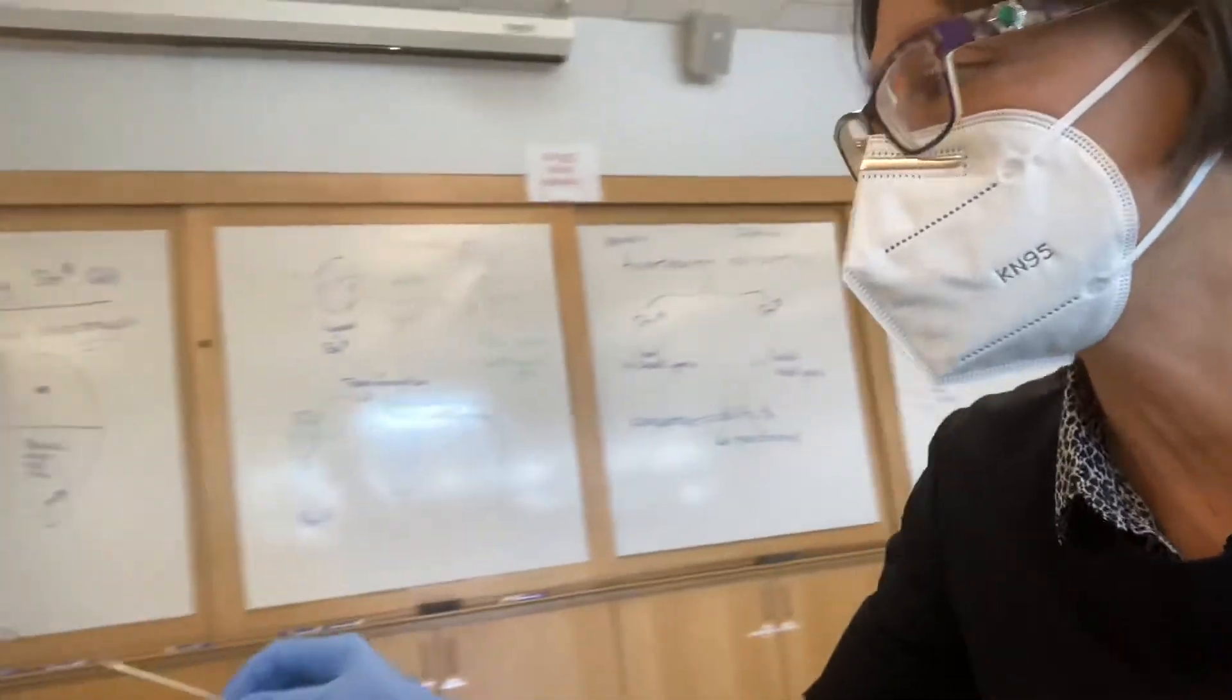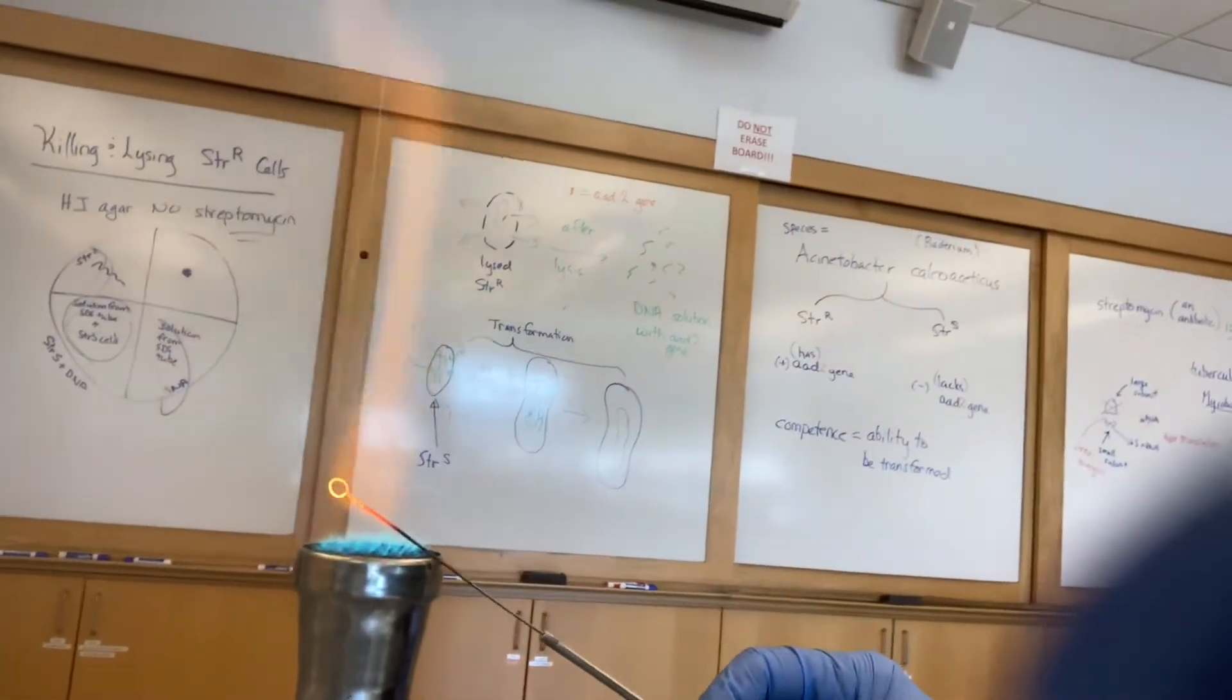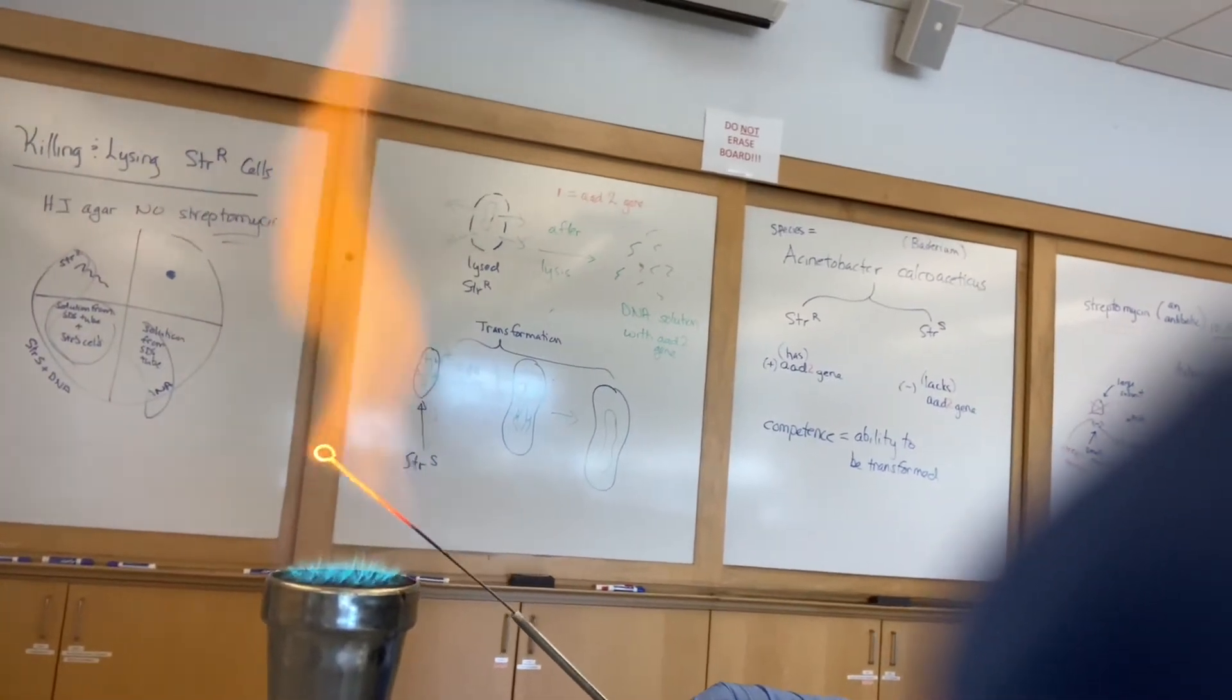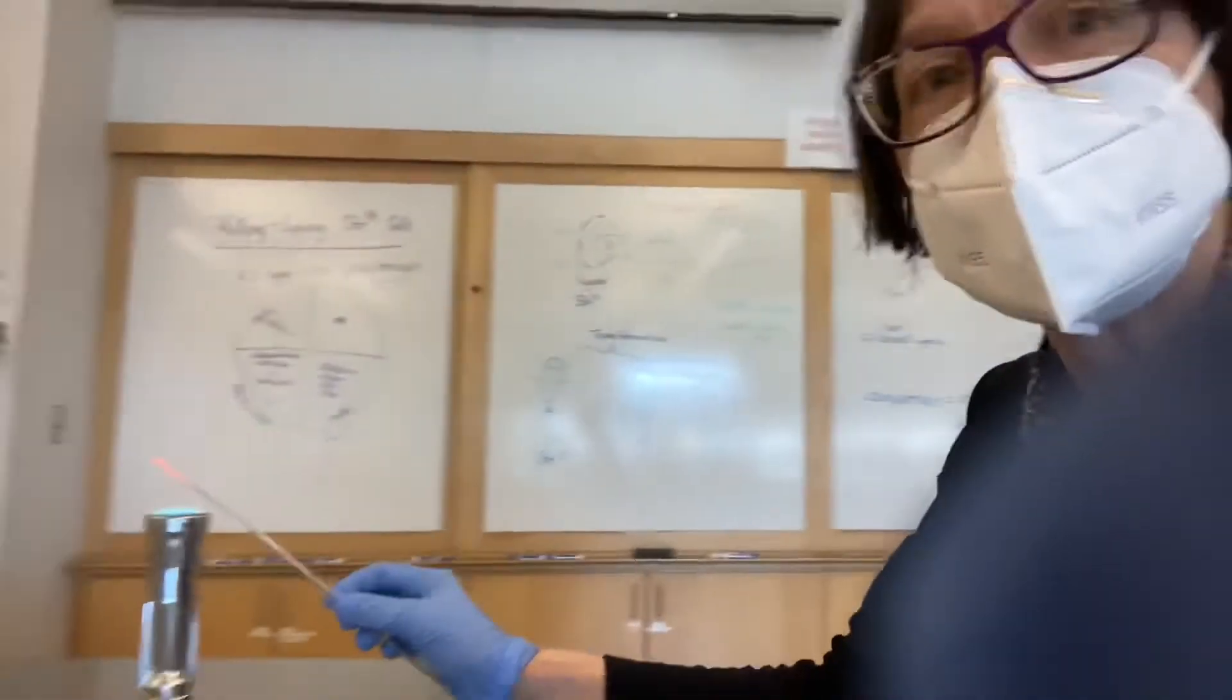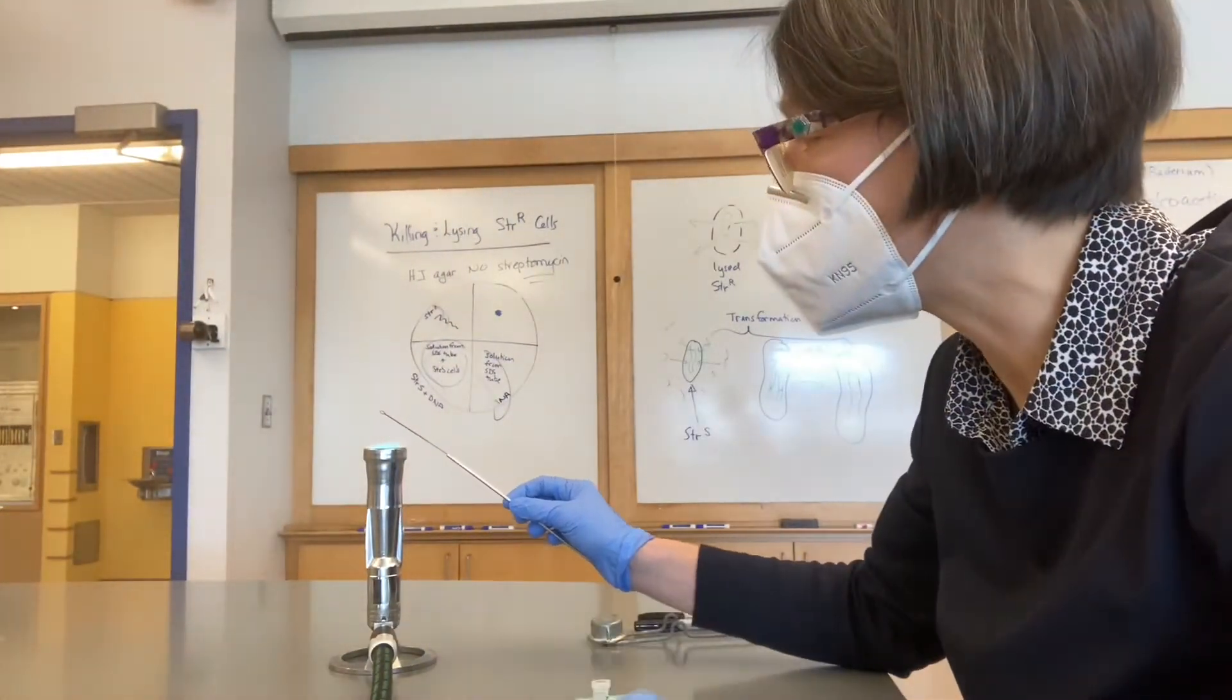Let me get a little bit closer here to show this. You can see that the loop is getting red hot, and that's sterilizing it. So I get that red hot.